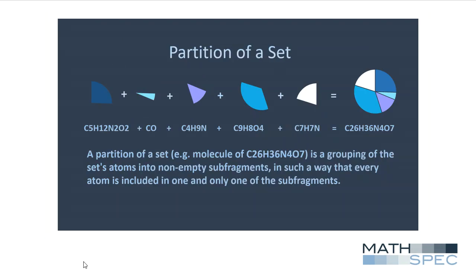The Excel add-in then checks for sets of 3, 4, or 5 masses that sum up to the mass of the precursor molecule. These are partitions of the molecular mass. This operation is very CPU intensive.